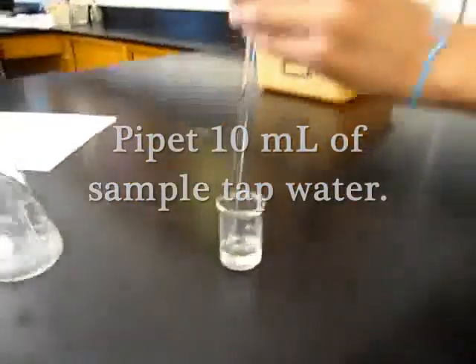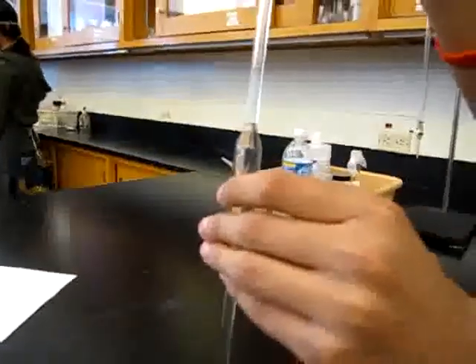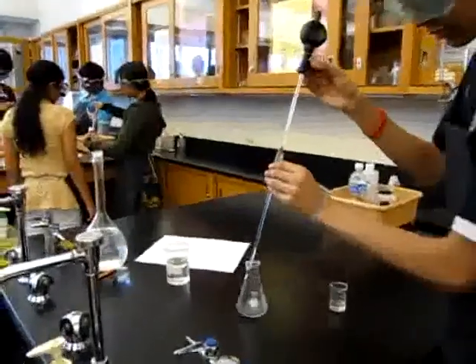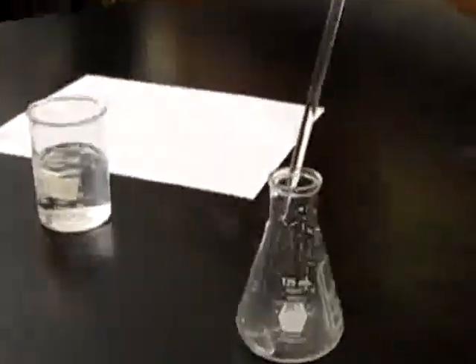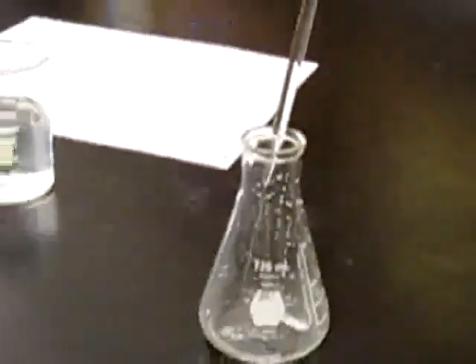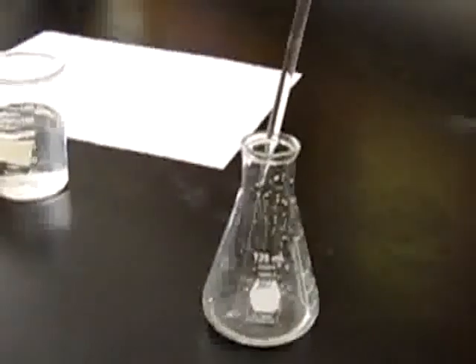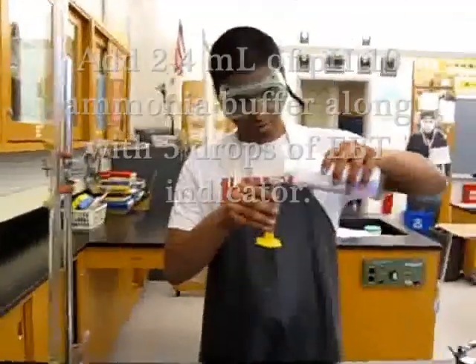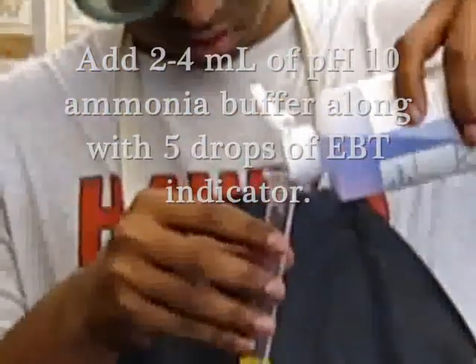Pipet 10 milliliters of the tap water sample into an Erlenmeyer flask. Add 2-4 milliliters of pH 10 ammonia buffer to ensure that the EDTA reacts primarily with the calcium and magnesium ions in the solution.